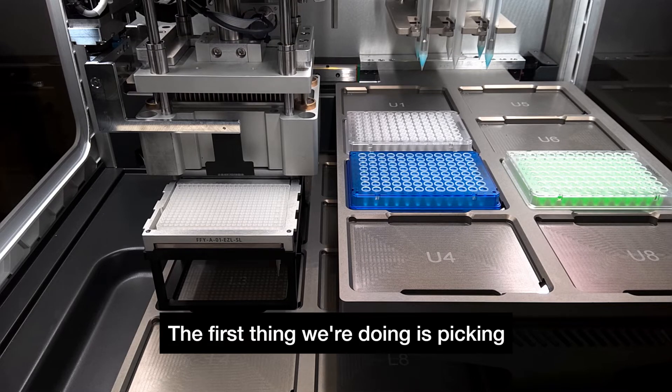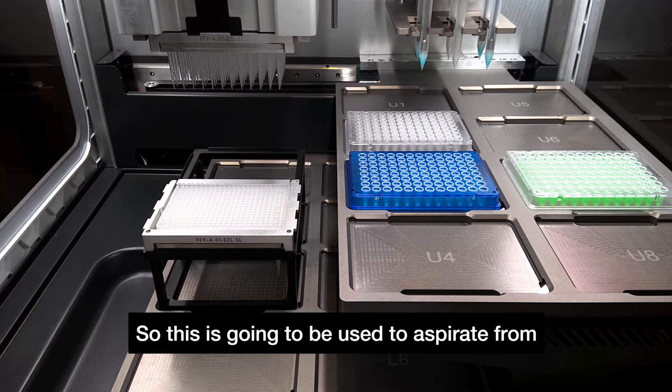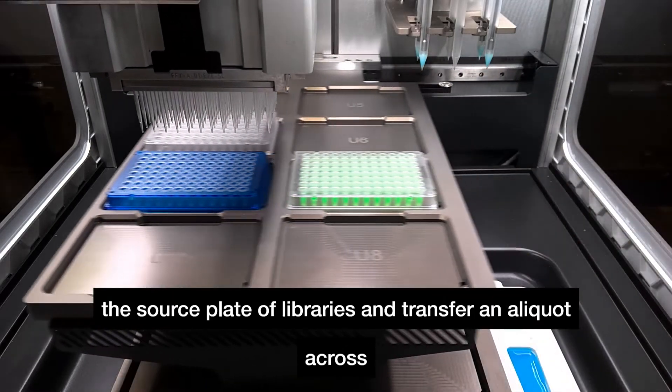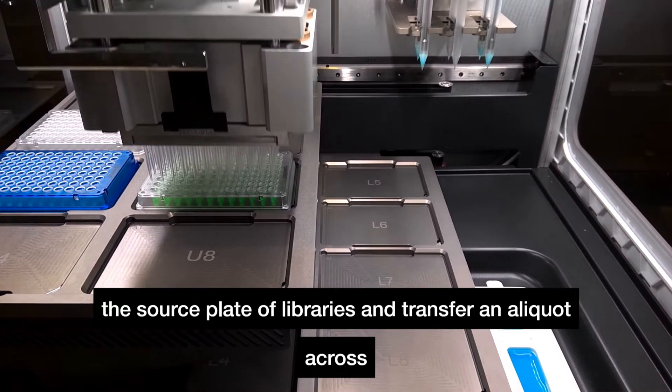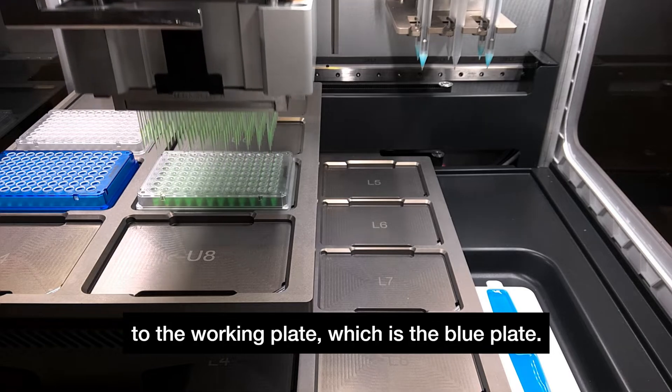The first thing we're doing is picking up a set of 96 tips. This is going to be used to aspirate from the source plate of libraries and transfer an aliquot across to the working plate which is the blue plate.